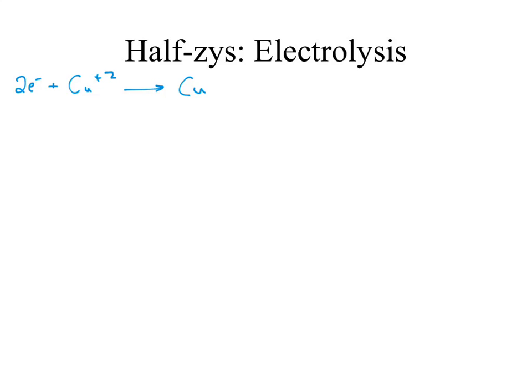That electric flow, or the amount of electrons pumped in, is going to get recorded in a unit known as amperes. I believe for this experiment you're going to run at roughly 2 amps. Any electrical engineers? How do you get amps? Actually, I think I remembered it.